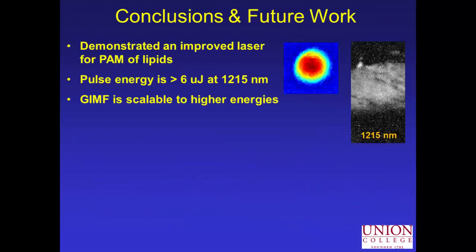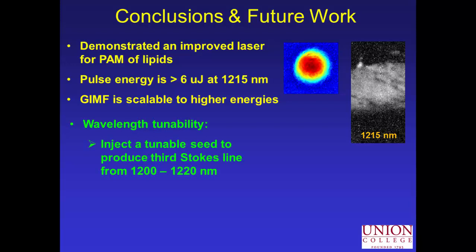To wrap things up, we demonstrated an improved laser system for, I should have said, optical resolution photoacoustic microscopy of lipids, with pulse energies of over 6 microjoules at 1215 nanometers. It is scalable to higher energies, mainly because the mode field is bigger than conventional single mode fibers, so they should be able to handle higher energies. And to get tunability, we're going to explore a route where we inject a tunable seed laser, and that will allow us to sweep the wavelength across the absorption peak of lipids.